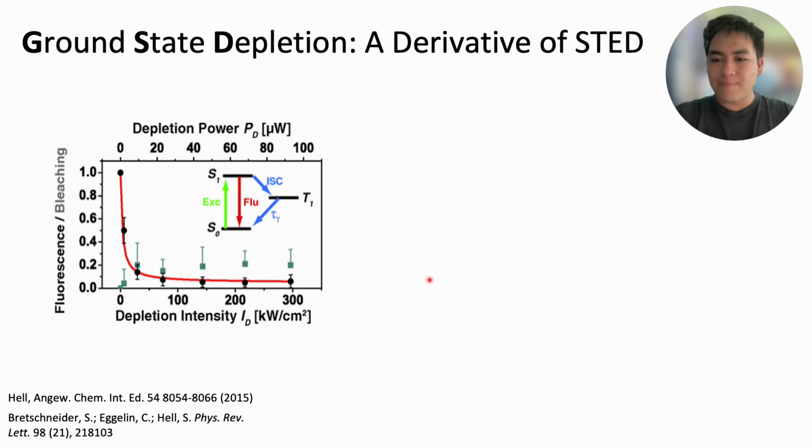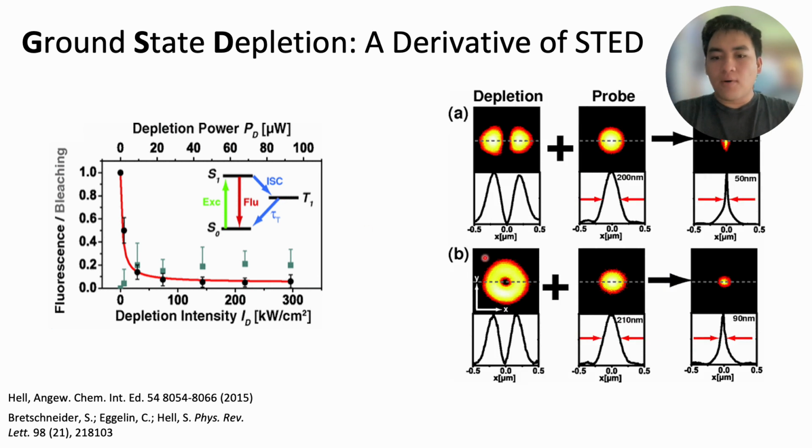And so why exactly would that be beneficial in any sense? Well, what usually happens is when you go from S0 to S1, you still have some residual electrons in that donut beam all around that still appear in the signal. But with this process, by moving it to a different state or a meta-dark state, you essentially get no signal at all. So you go from having a little background noise to no background noise. And because of this, you can get an even better resolution with the better resolution in the point spread function, which allows you to observe these smaller molecules with even better details.